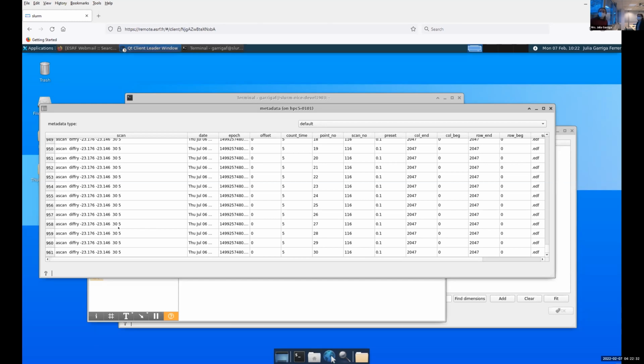Also, in some of the scans, you have the value minus 1 for the first of the quick motor. But it's not in all of them, and sometimes it's the size, so it's the number of steps or the number of steps minus 1. It depends on the scan. I think it takes either 30 steps, in this case it's going to be 31. Yes, exactly, that one.